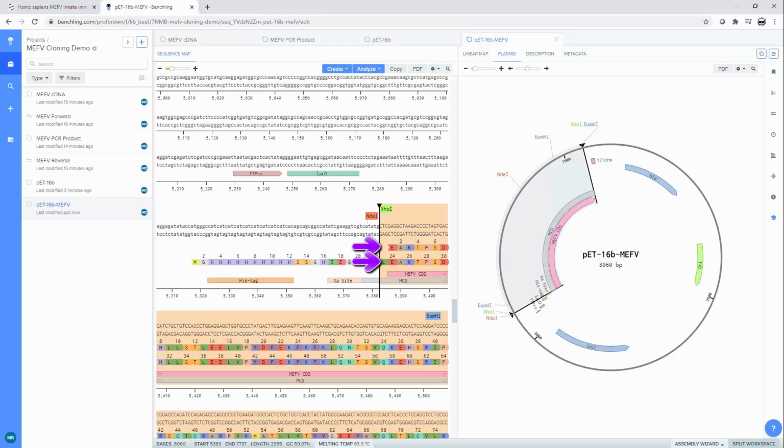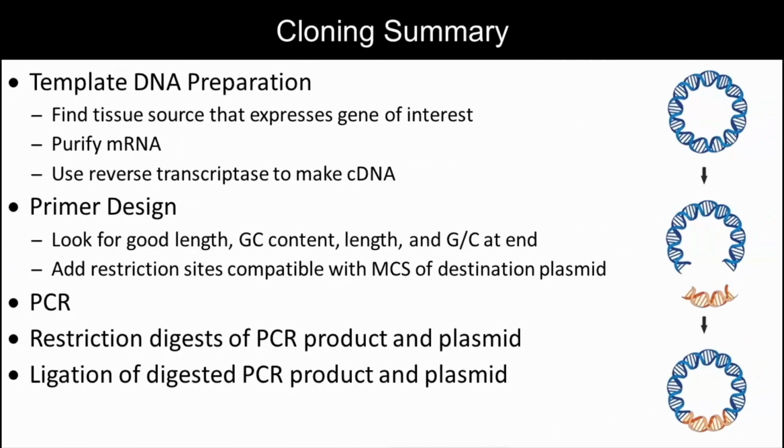The 6 bases correspond exactly to 2 codons. The BamHI site isn't aligned like that. This is why I said your primer has to have an extra base between the cut site and the start of your gene when using this enzyme. If your sequence doesn't align nicely like this, you have accidentally added or forgotten an extra base at some point. Review your work carefully. So that's the idea.